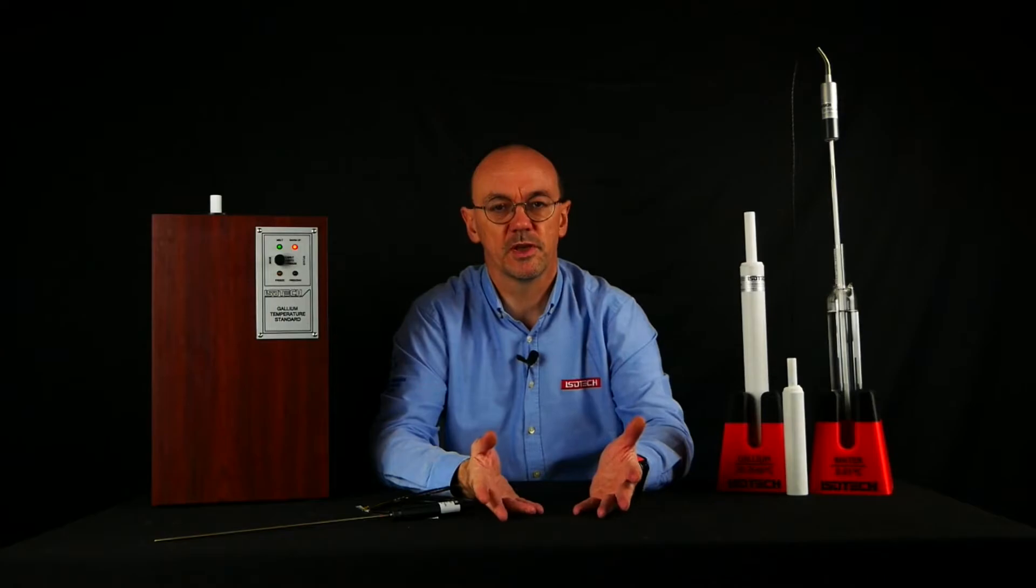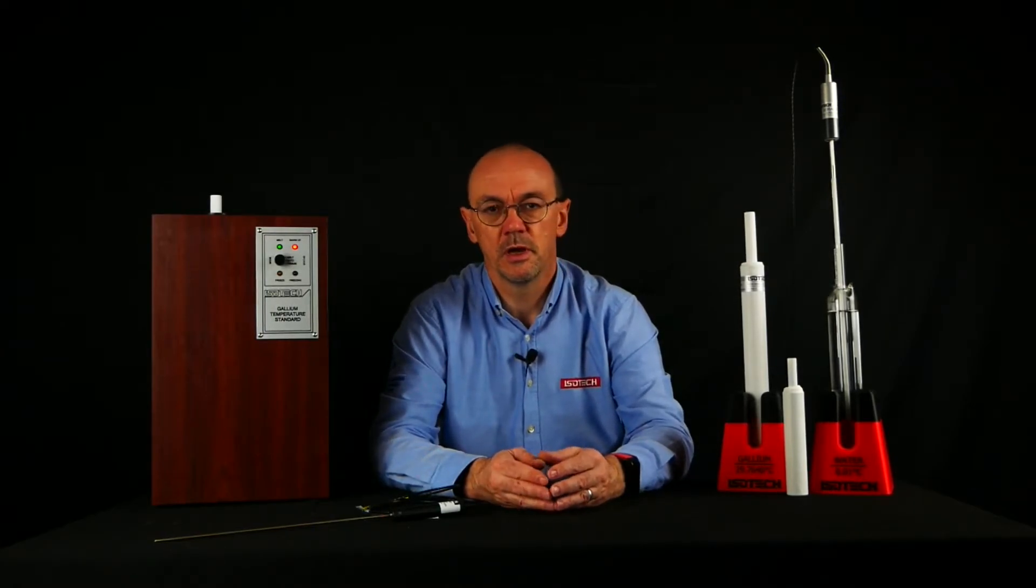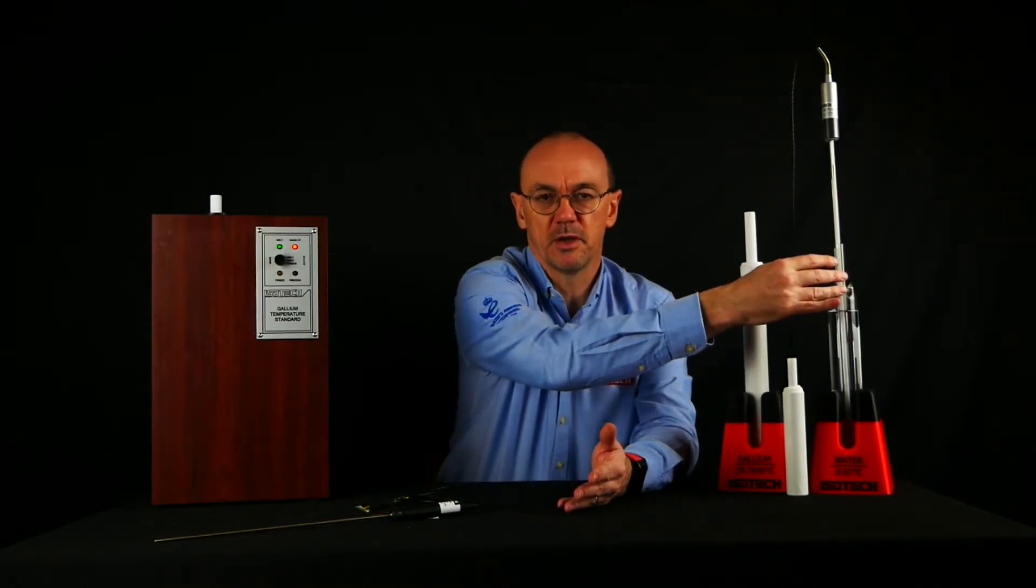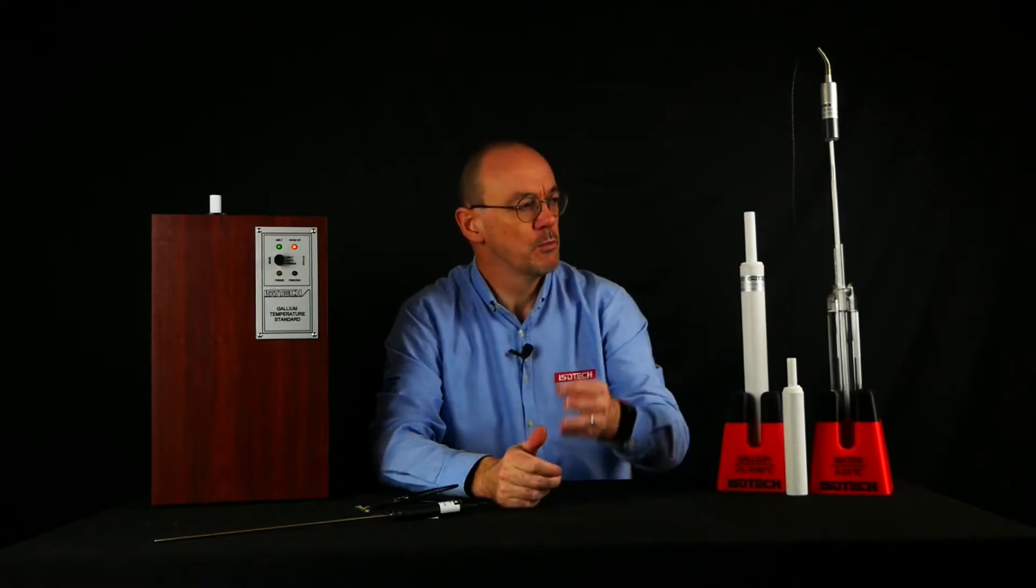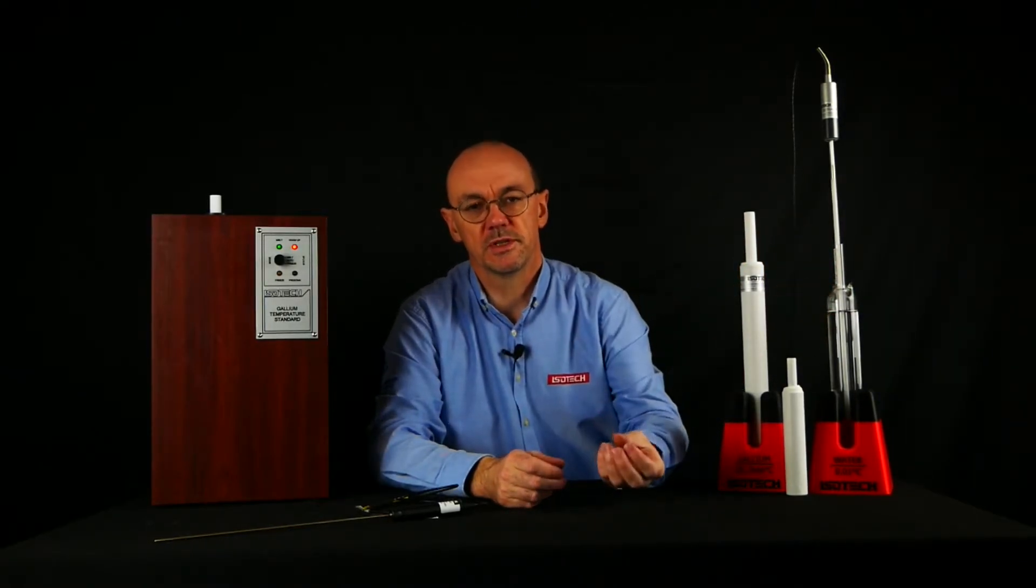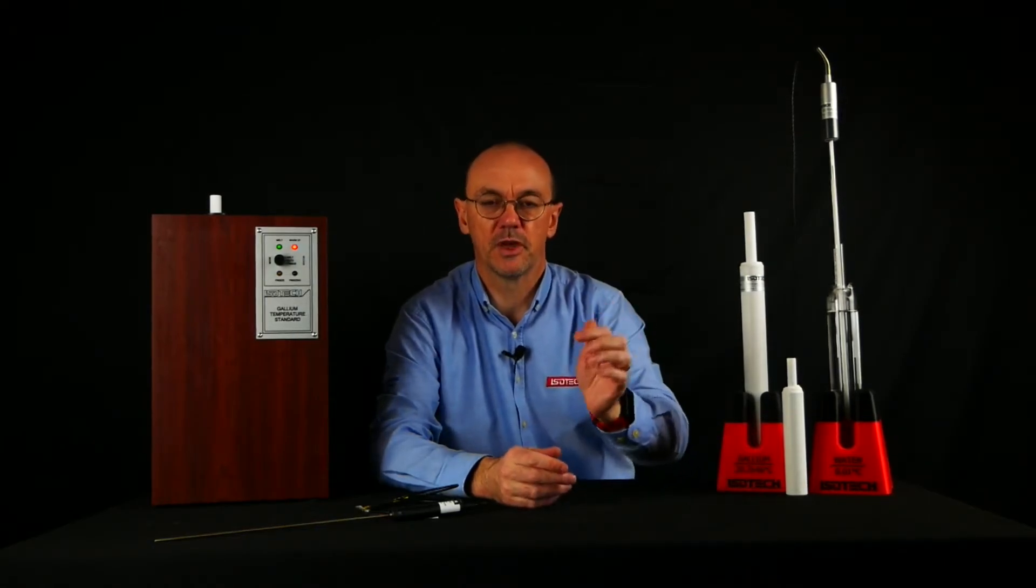The gallium fixed point is really useful in temperature metrology. In an earlier video we've looked at the water triple point cell and how that's fundamental for the calibration of SPRTs. But if we check an SPRT at a single temperature, we can know its resistance at that temperature - it only tells us information at that point.